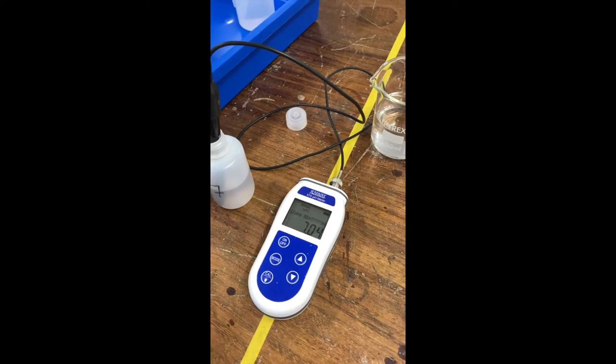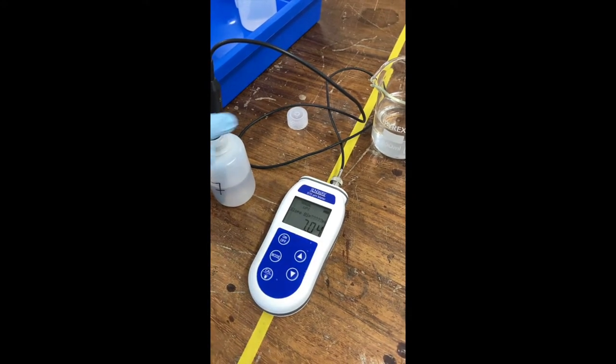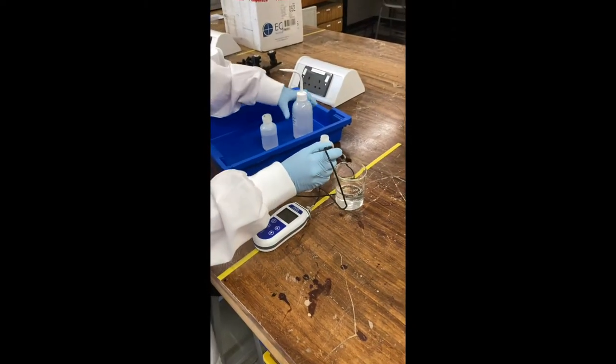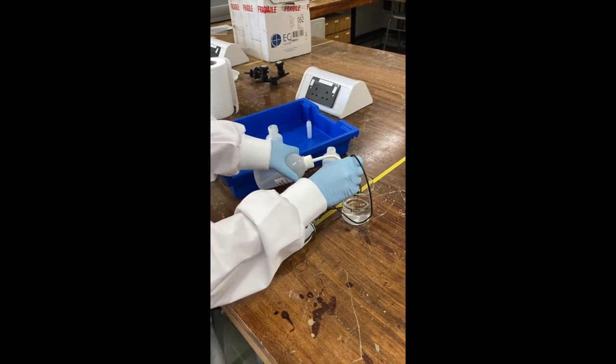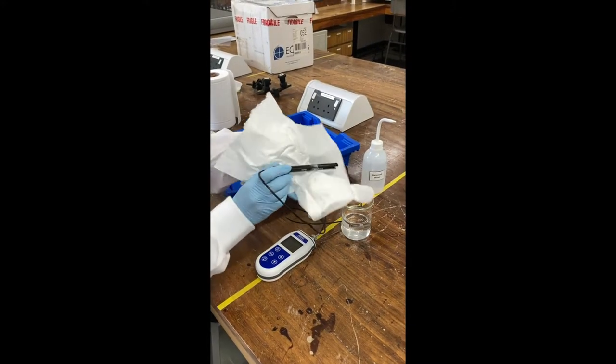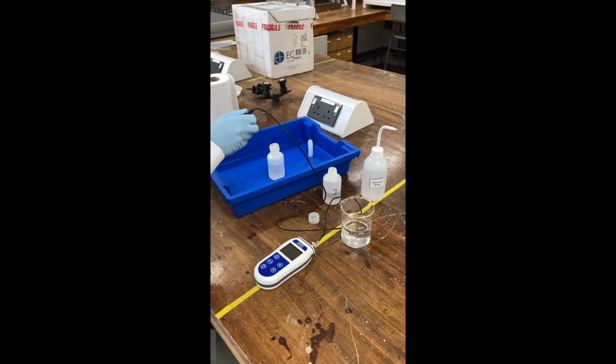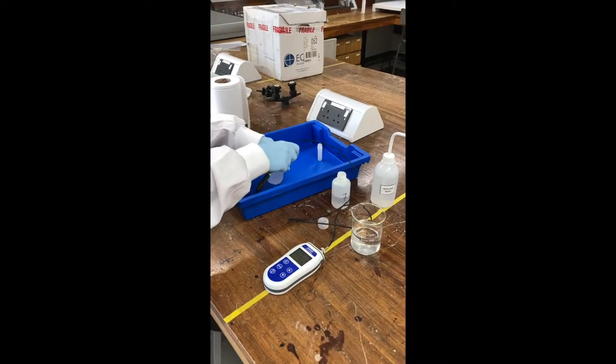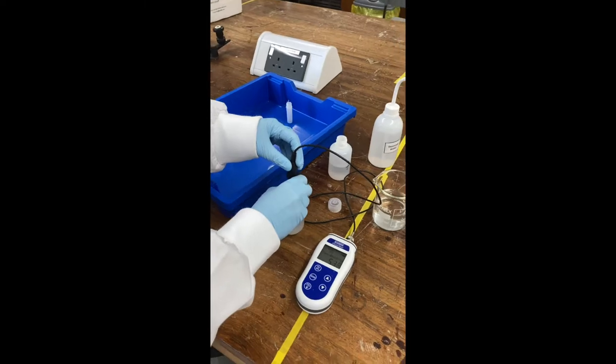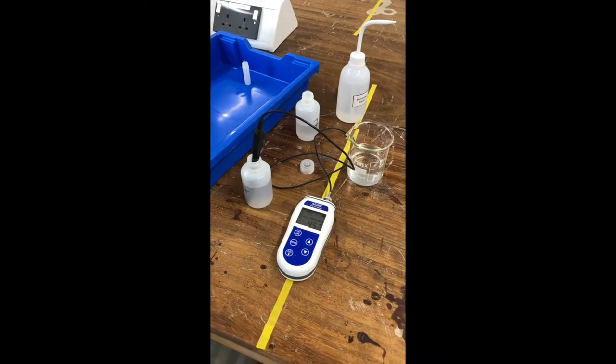You'll then need to do a slope, so that will either be a pH 4 or a pH 10, so follow the same procedure, removing the probe from the previous sample. Rinse it thoroughly and dry it with paper towel, and place the probe into your new sample. Give it a little mix and wait for the readings to settle.